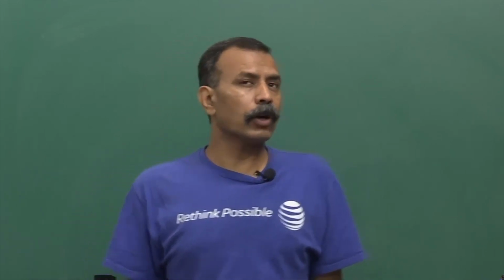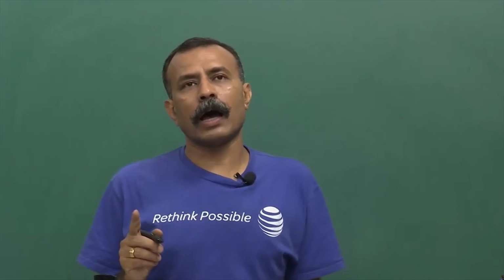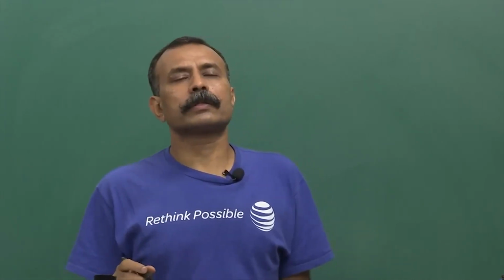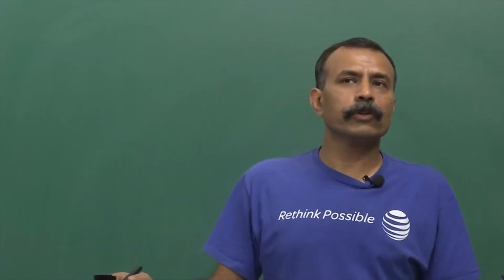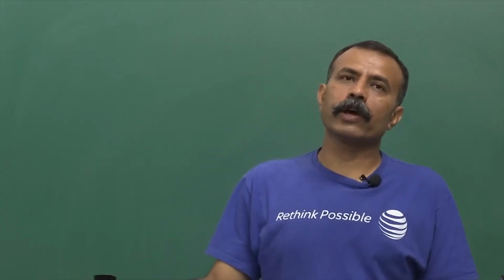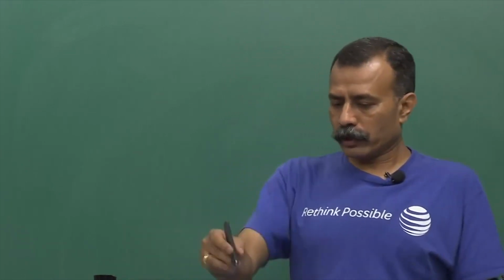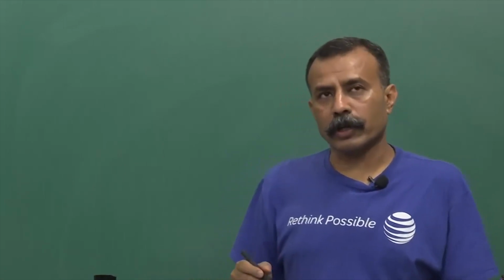So, you will be needing autoclaves, and ensure that they are according to the requirements or number of end users. You do not want to get very huge ones, which are tough. There are modern-day facilities where they have centralized autoclaving. So, just before I get back to the dissecting thing, let me talk about this autoclave.